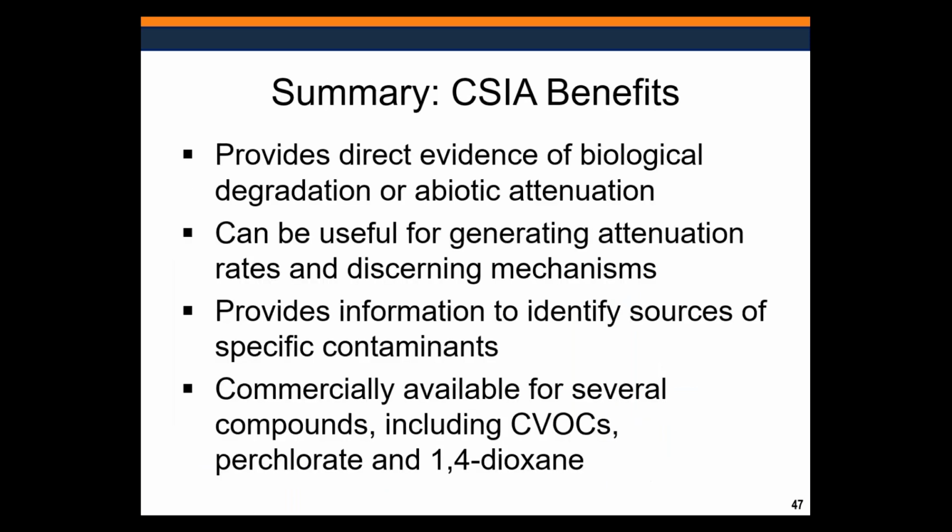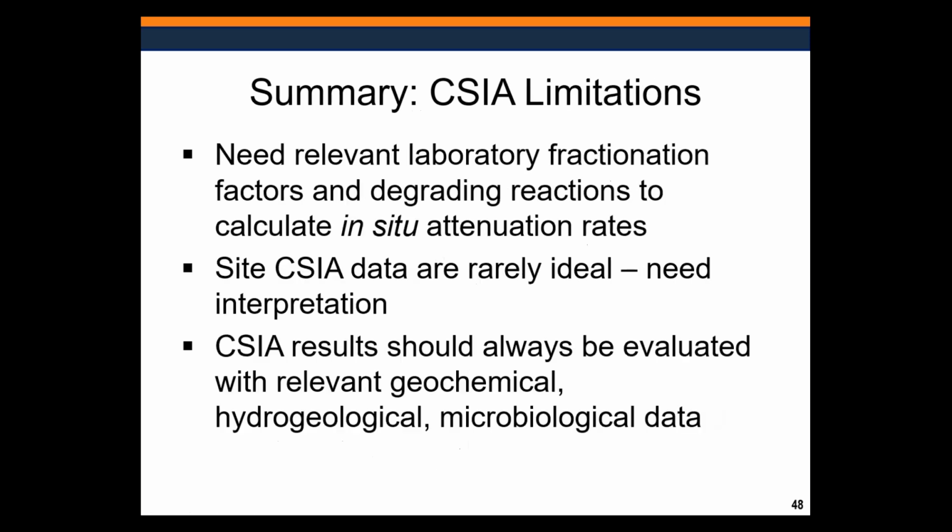So I'm going to wrap up right here and basically just say there's a lot of benefits to this. Provides direct evidence of attenuation, can be used for generating rates by different means. You can identify sources of some contaminants. It's commercially available for a lot of compounds, including VOCs and 1,4-dioxane.